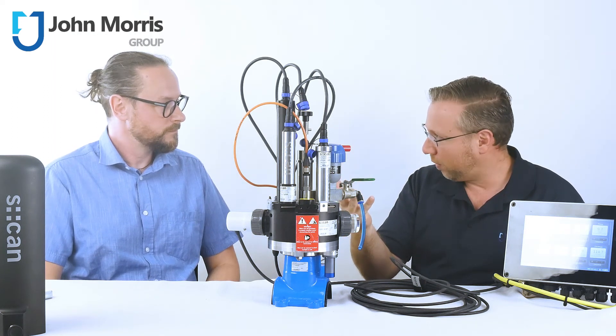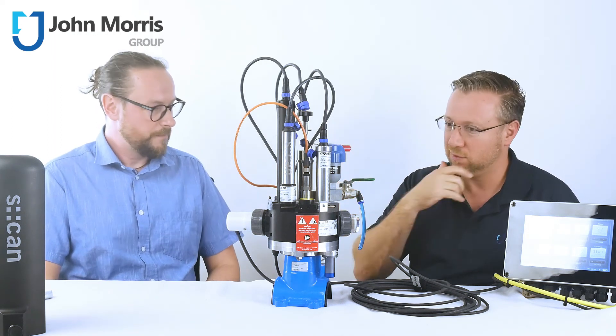You said 10 parameters? 10 parameters. Right. All at once. All at once. Wow.